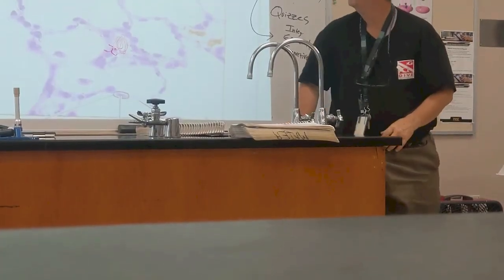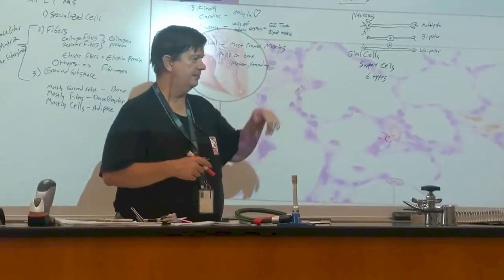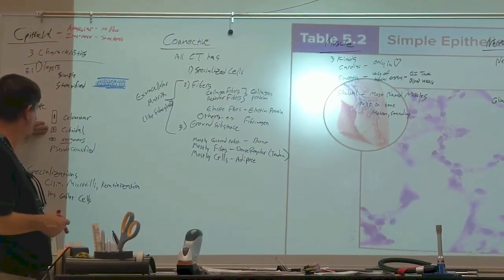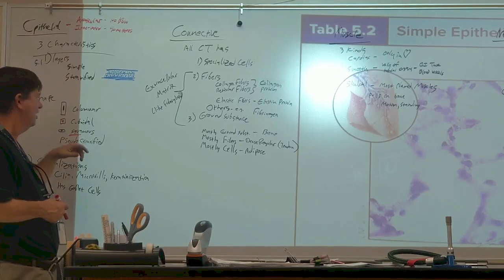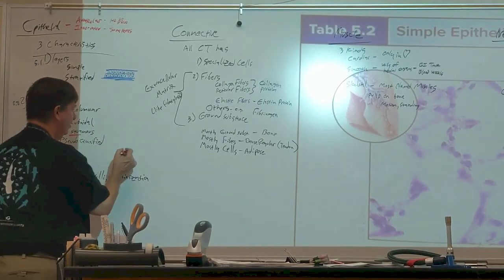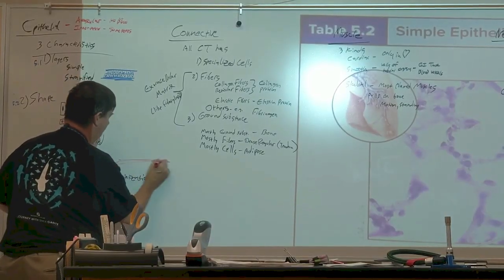And we've done one of the 4 epithelial tissues on the table now. We talked about squamous. I'm now going to talk about one that is on the table, but it's a shape we haven't talked about yet. We've talked about columnar, we've talked about cuboidal, we've talked about squamous. Now we're going to talk about pseudostratified. Are you with me? So we're going to draw us the tissue. I'm going to draw a tissue up there. We're going to draw us the tissue down here.